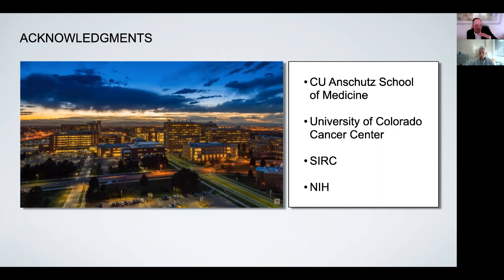So to give you a very rough sense, under ideal conditions, if you had specimens with high particle density that were well behaved, you perhaps would need about 2 days on the large microscope for data collection. That could add up to about maybe $1,200 to $1,500.